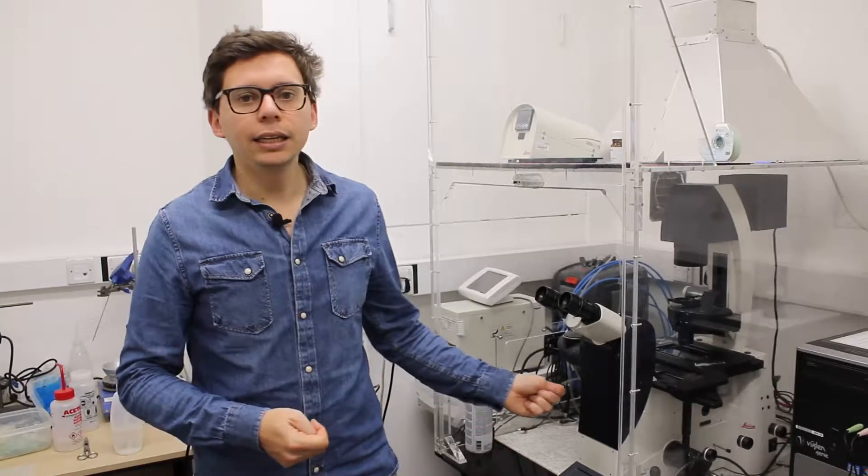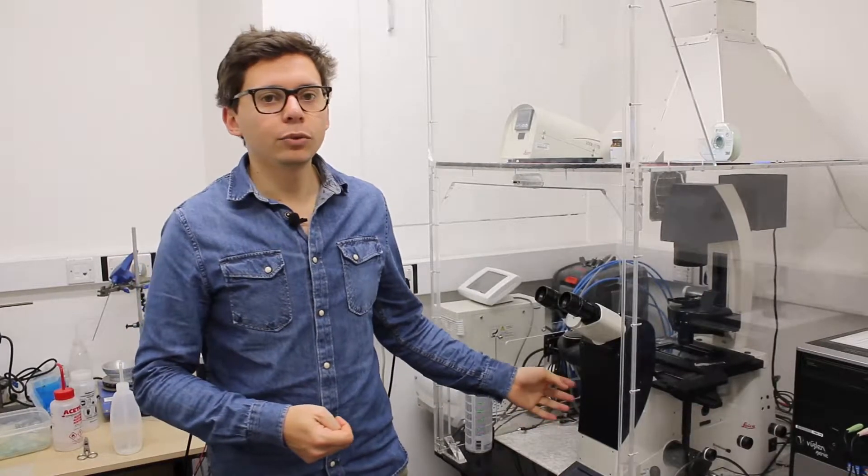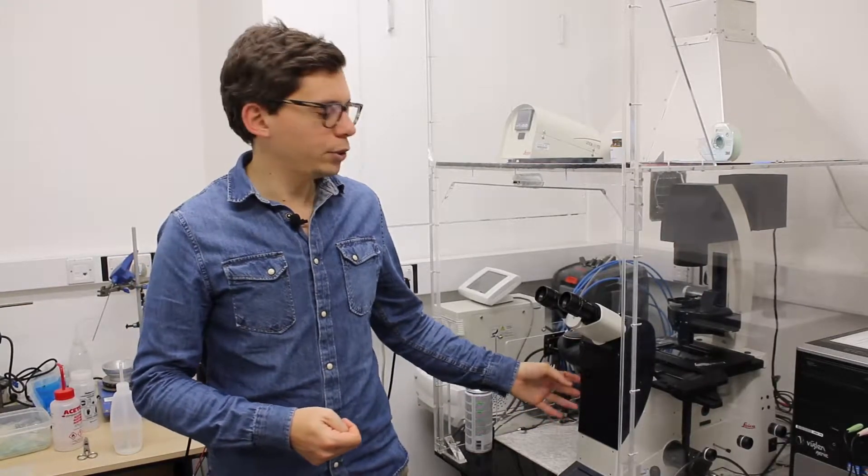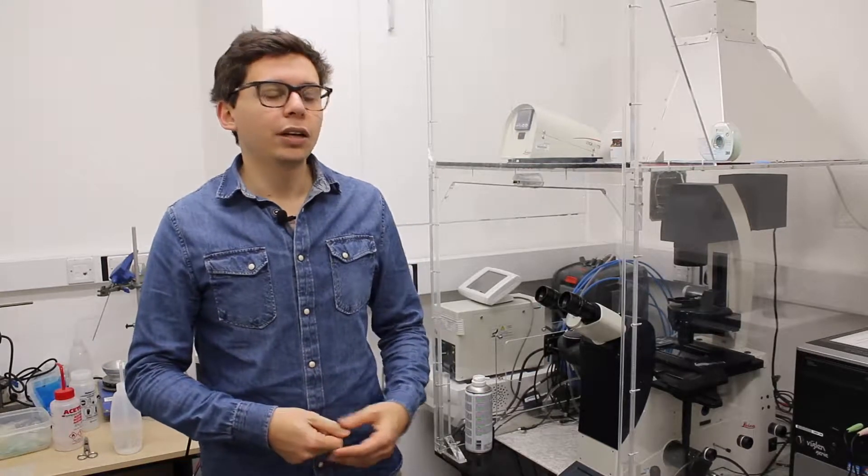This is the Leica Fluorescence Inverted Microscope, and today I'm going to show you how to use the Brightfield mode on this microscope.